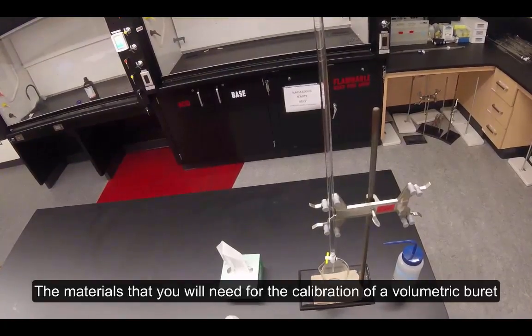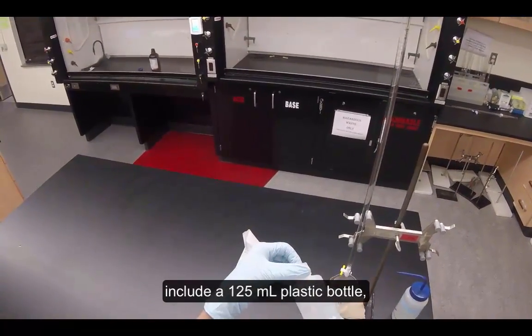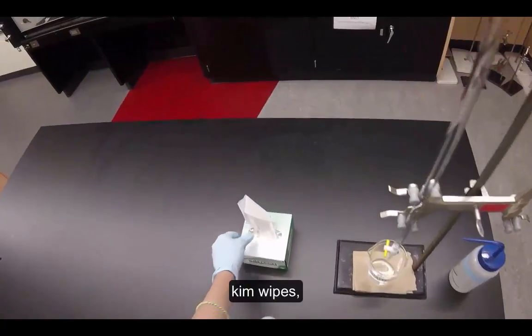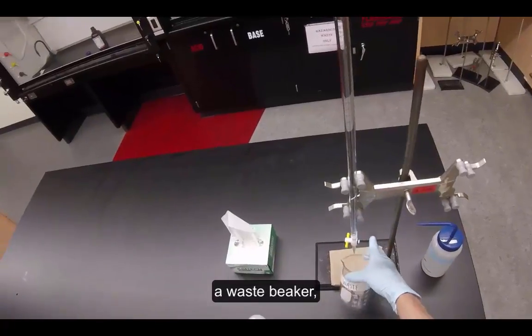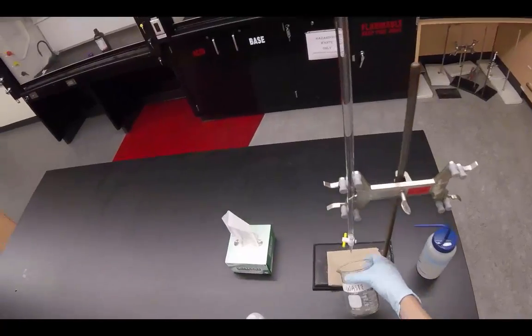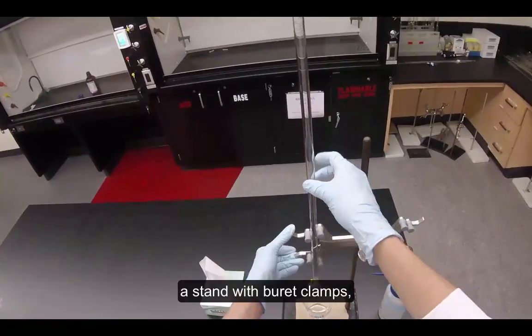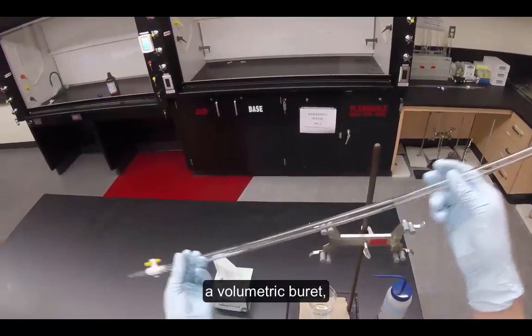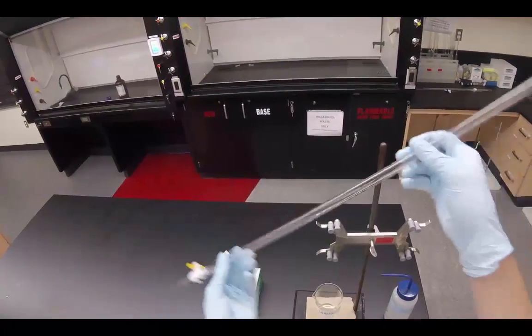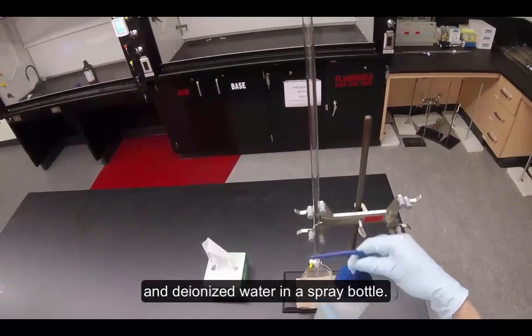The materials that you'll need for the calibration of a volumetric burette include a 125-milliliter plastic bottle, kim wipes, a waste beaker, a stand with burette clamps, a volumetric burette, and deionized water in a spray bottle.